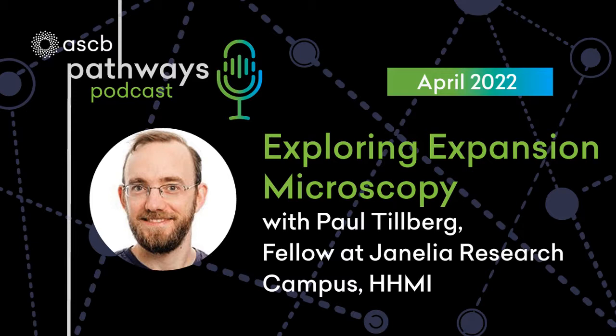But you can get around that, and people have done this by doing ultra thin slicing. So for electron microscopy, you slice in Z and you get, say, 70 nanometer thick slices. And so that's what you need to do transmission electron microscopy. But that also gets you a much better Z resolution than you would normally get with an optical microscope. So the optical resolution could be on the order of 500 nanometers, and that could be like the best you can do without getting to really crazy things. But by slicing at 70 nanometers, you can dramatically improve that resolution just by the slicing.